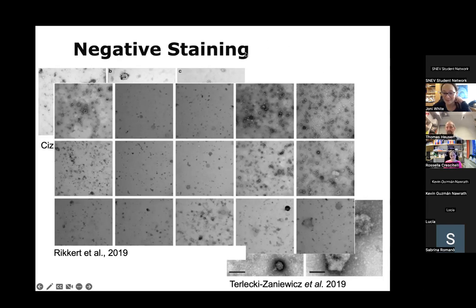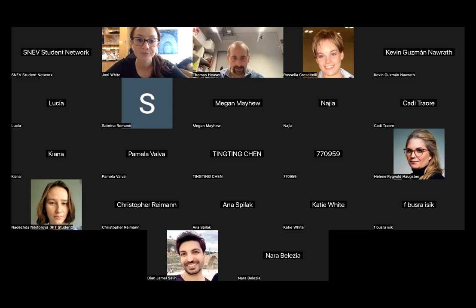Well, thank you. And so the next question is from Lucia, and Lucia's asked, what are recommended buffers to use in conventional TEM for human EVs coming from plasma, serum, or saliva, so as to minimize the buffer's signal? Sorry, I didn't quite get this.